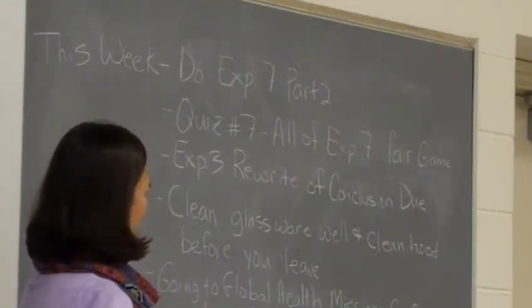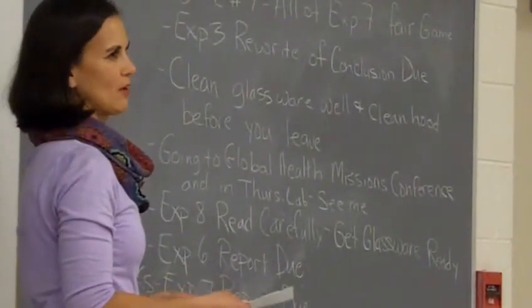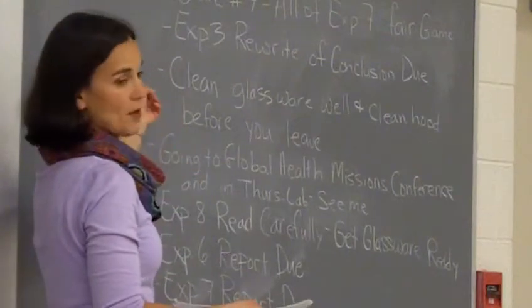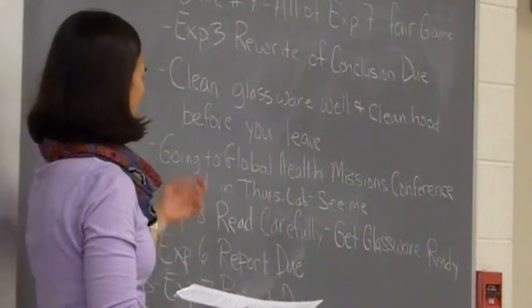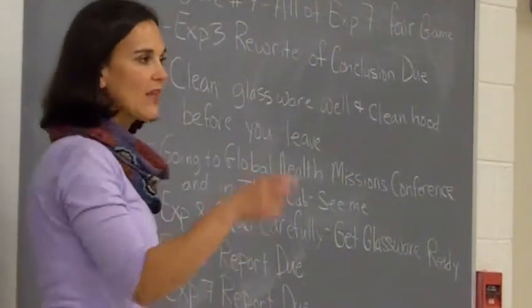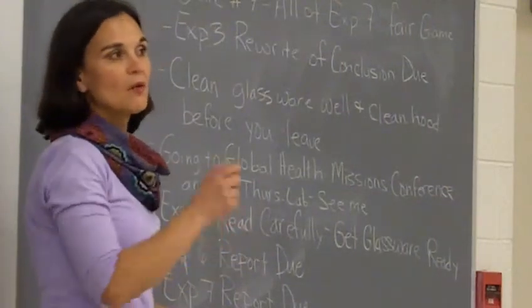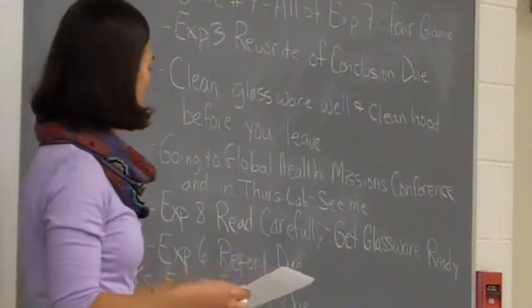Clean glassware well before you leave lab each week. We have a lot of people needing to exchange glassware or do emergency cleanup of glassware. So in order to prevent that, make sure before you leave each week your glassware is cleaned well and dried, or at least has acetone in it so it will dry, and then make sure you're cleaning your hood up before you leave. Be careful. Around in the hoods there could be little bits of glass if glass broke in the hood, so when you are cleaning your hood, use a sponge. Probably wear gloves so that if there was any stray glass in there, it wouldn't cut you.